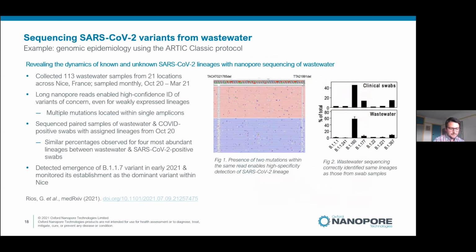So one thing that is of interest to people going forward is being able to monitor an outbreak and monitor other diseases or pathogens in a less invasive manner. And this group in Nice were able to monitor the SARS-CoV-2 in wastewater samples that were collected monthly anyway from 21 locations. And what they're able to do is actually say, well, 2 weeks before an outbreak actually kicks off, or a variant outbreak is really monitored through people self-identifying, you're able to pick it up in the water.